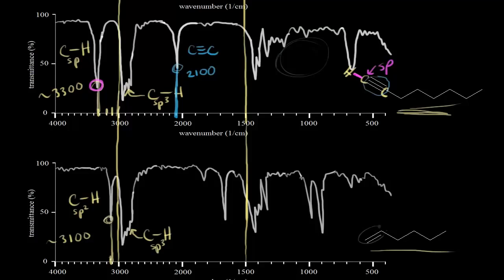And obviously here with this double bond, we know we have an sp2 hybridized carbon. Notice the difference between this one and the one we just talked about. So let me go ahead and highlight this here. This signal shows up around 3,100, so I draw a line up here, and we saw the other signal at 3,300. It's useful to think about. It helps you distinguish on your IR spectra if you draw a line there and think about where the wave number is. What wave number does this signal appear at?